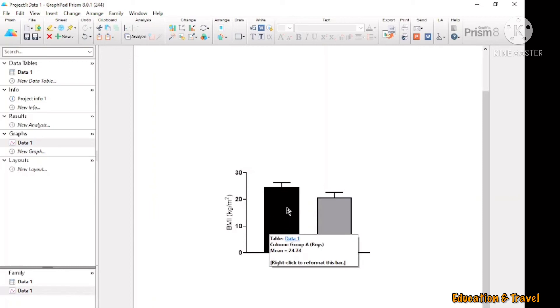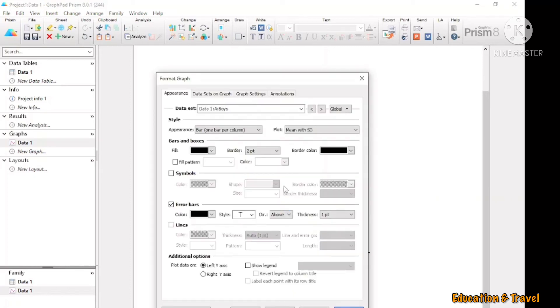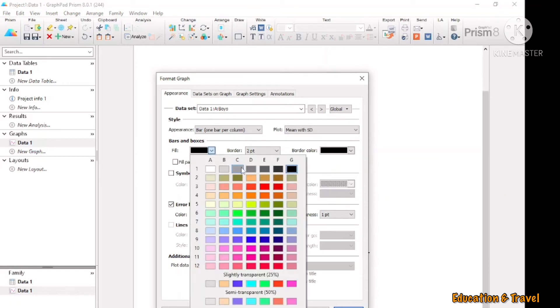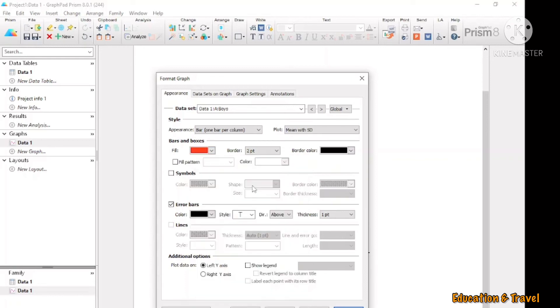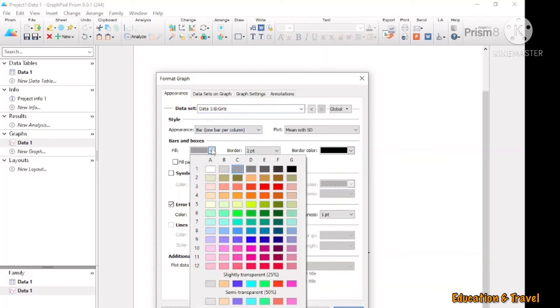If you want to change the color, then you can click here. Click here, and I want to use this color. I want the border to be half. Then I click here for another column, and I want to use this color.